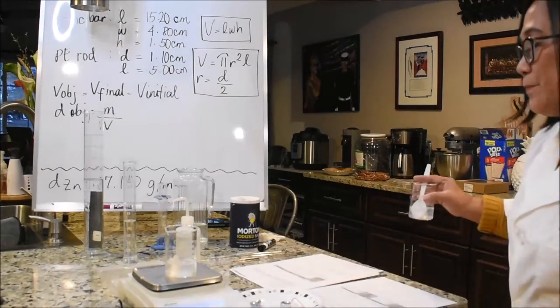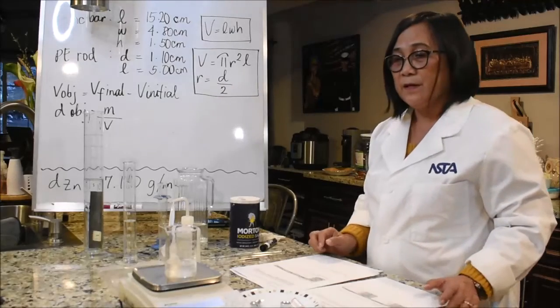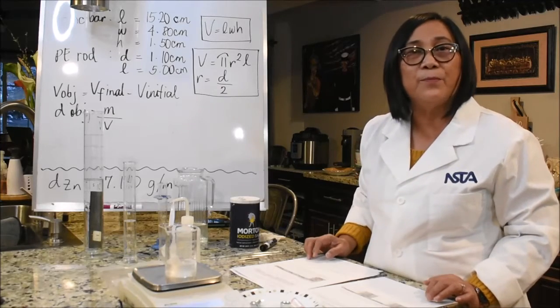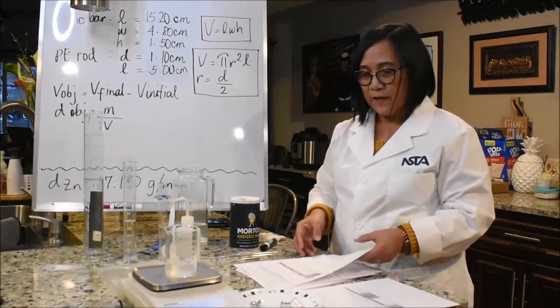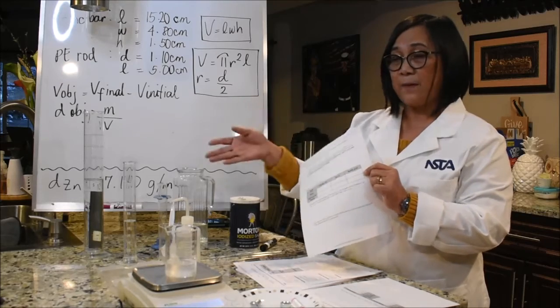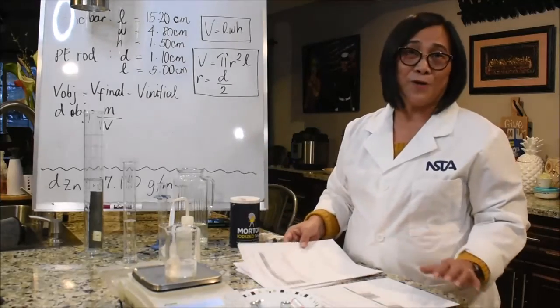Wow, that's perfect. Okay, so our mass is 123.2 grams. The mass of 50 ml of saturated salt solution is 123.2 grams. So there you go, guys. Again, fill in the data on table 2.3 and you will calculate the density of the tap water and the saturated salt solution. The last part of the experiment you will have to do on your own, and this will require measurement of the dimensions of your room wherever you are.